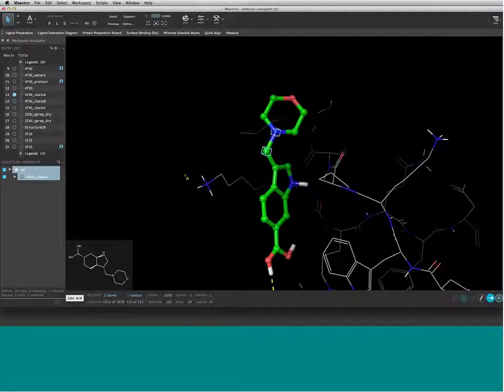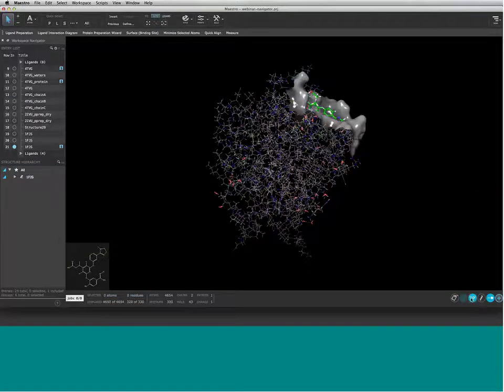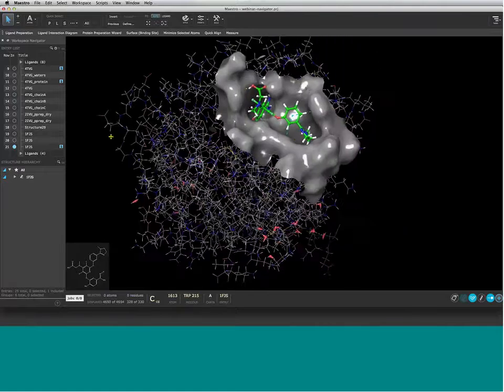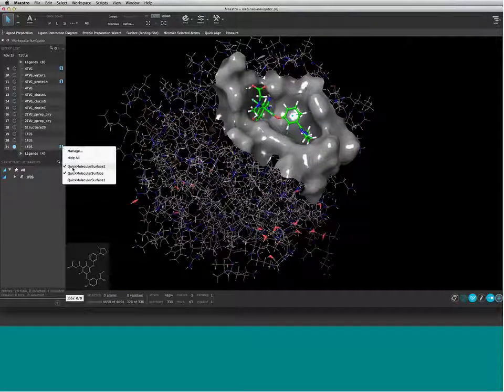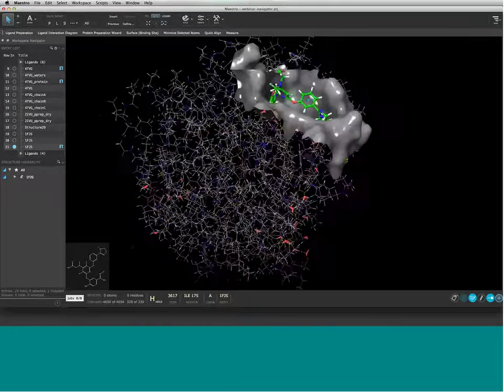So the next part has to do with right-clicking on auxiliary features that are in the workspace. We'll create a demo surface, or maybe you can just pull up one of the surfaces you already created. Make sure that when your mouse is over an area of the surface that has no visible atoms or ribbons underneath it, you'll notice the cursor will change to that regular black cursor, and next release will have a little surface icon to replace the A. If you're having trouble getting this cursor to show up, make sure that any atoms or ribbons in your way are hidden or out of the view so you can right-click right on the structure.